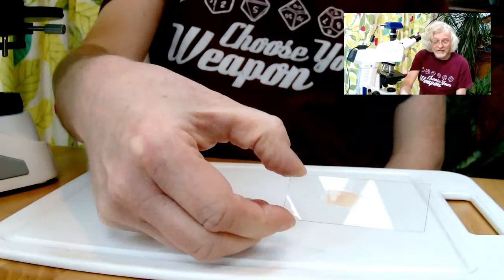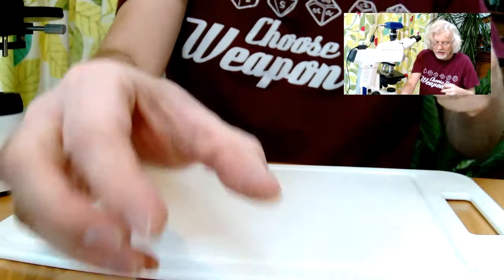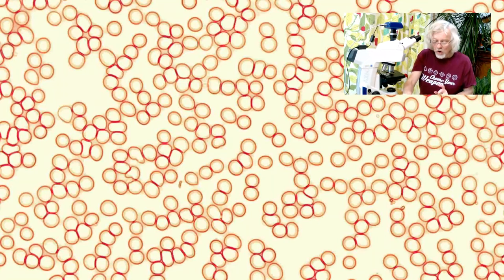And then this needs to dry out. Whilst it's drying out, I've got a little heater here, which heats the slide for me, and that helps things dry out. In fact, it's drying out very quickly, so let me just show you what it looked like last time. This is what red blood cells look like. This is a still, this is not live. This is what they look like just under the microscope normally. So, no staining, nothing. They don't really look particularly red, and they're just little round blobbies.